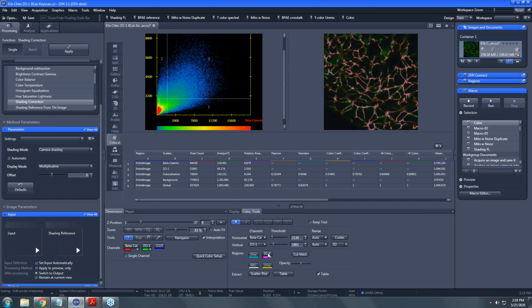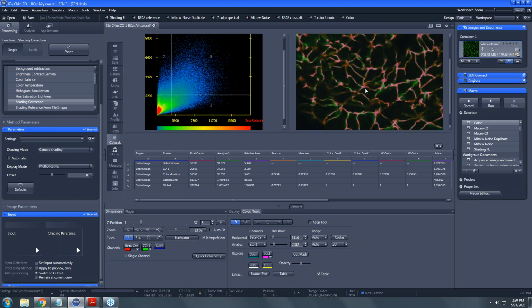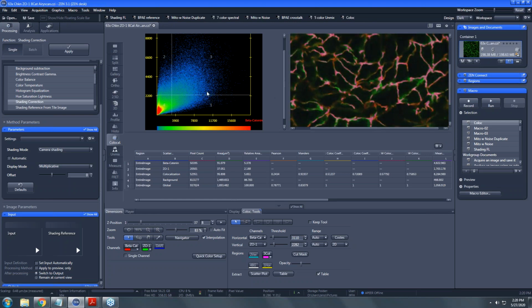So the purple channel. So this is a mask. You can see it's purple now, or what is that, a fuchsia, a pink? What are we looking at anyway? There's some staining now in the image that shows where the colocalization is being measured. And as we drop the threshold, you'll see that mask increase and increase. So if we can drop that to the bottom left, Nicole, just so it overdoes it at some point and it's really obvious to people. There you go. Yeah.